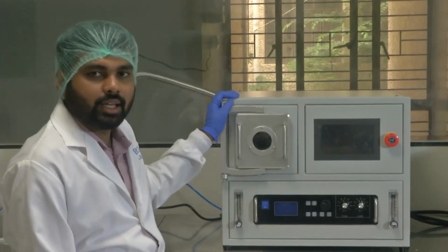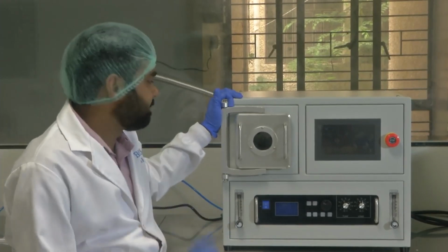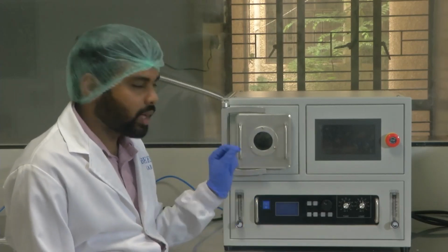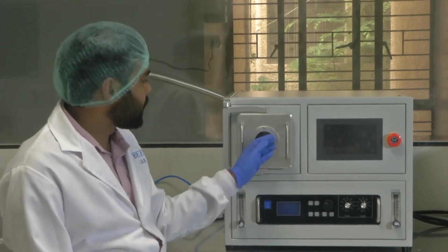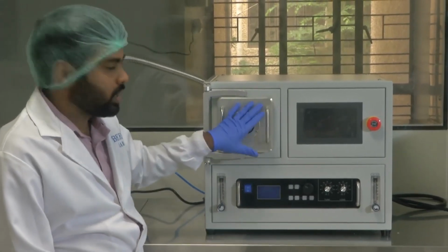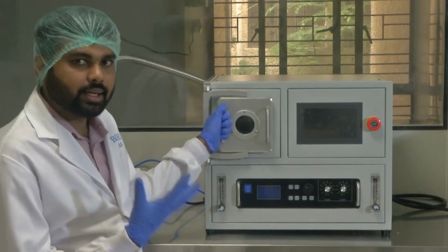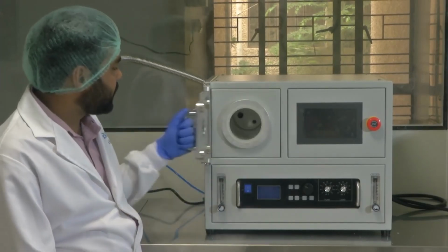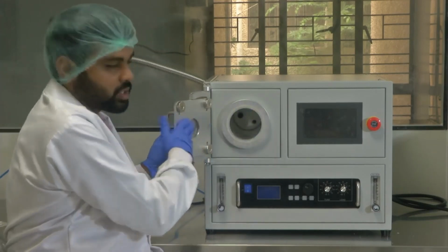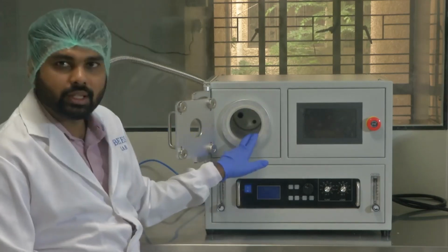So now let's get into understanding the main chamber and oxygen plasma main system. Okay, I have not powered it on. Before I power on, let me show you what the individual components are. The heart of it, where we actually use it, is the chamber. This is the chamber. It's a magnetically sealed chamber. So I am pulling it. There is a magnet here and here. Magnetic attraction is there, because of which it gets sealed properly. Let's zoom into the chamber now.